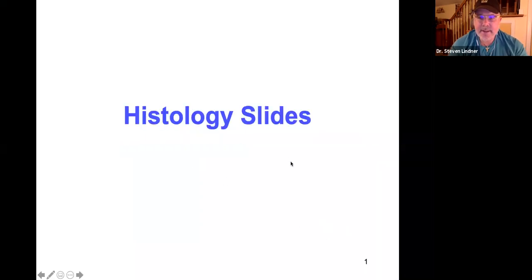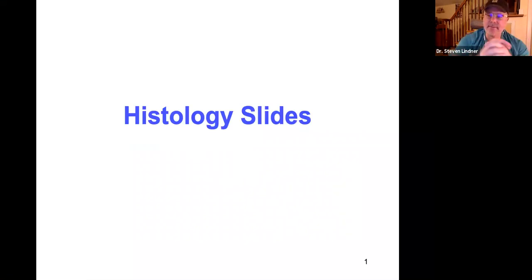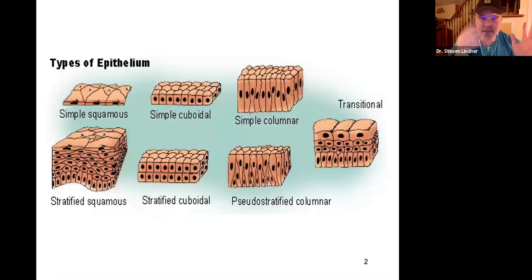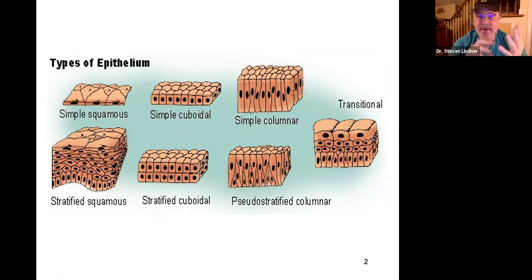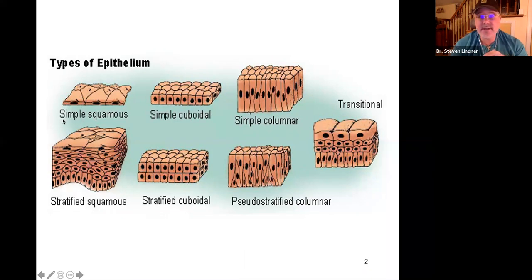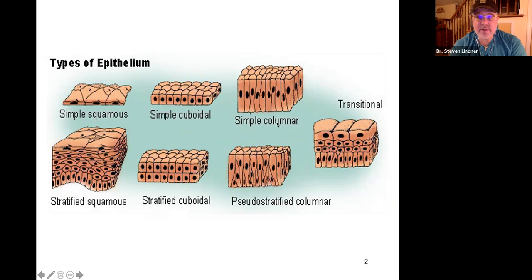We're going to be looking at some histology slides — some will be epithelium, some will be connective tissue. To identify epithelium, you need to see lots of cells packed closely together. Then determine if it's one cell layer thick or multiple layers. If the cells are flat and irregular, it's squamous; if cube shaped, it's cuboidal; if they look like tall columns, they're columnar.